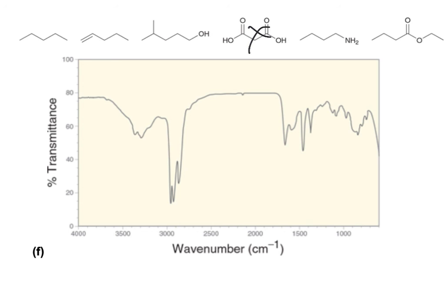Let's see if it matches up to the spectra that's shown. An amine, the NH stretch, is weak and generally will occur around 3300. So check, we have that one. Then you have our CH stretches, and you have CHs present. And then you have really a fingerprint region with minimal signals because most of this compound is an alkane. So our final compound is this amine, and it matches with the IR spectra.